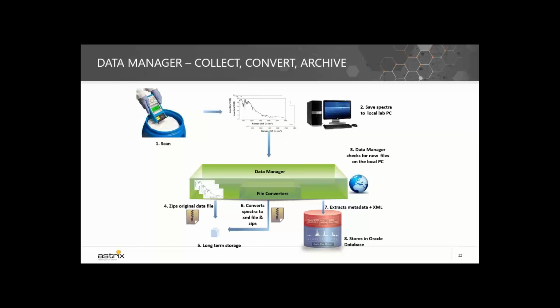So this really tries to summarize everything that I've been talking about in this module. So basically, in your daily activity in the lab, you have these different instruments producing different types of raw data. They may be saved locally on the computer, or they may be saved on a network share. So Data Manager is going to come in and monitor these repositories of data, and bring that into a safer repository.